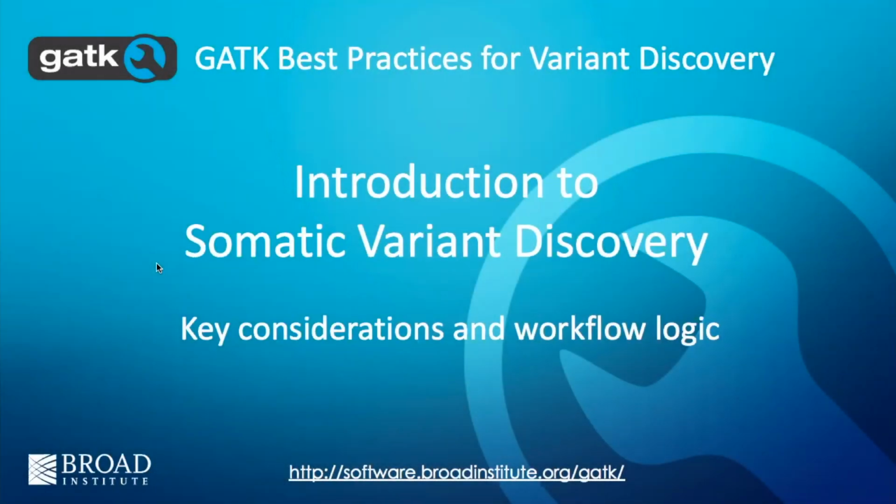So this morning we talked about intro to sequencing, processing the data, calling variants from a high level, both germline and somatic. Germline, and now what we're going to do is the somatic variant discovery overview.